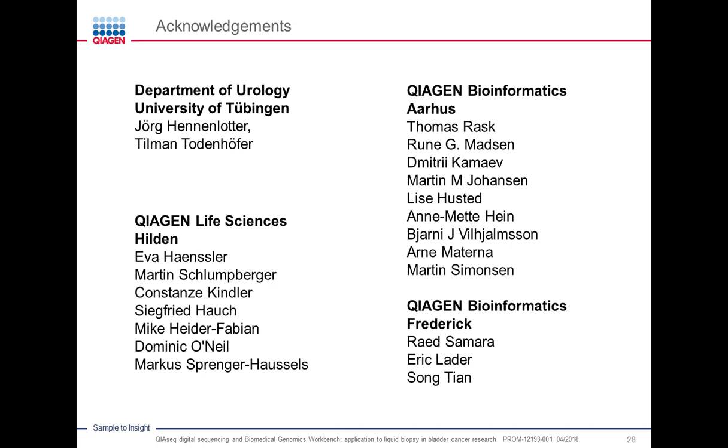And Dr. Lescai, it looks like we have time for one more question. How can you filter the variants you called in the workbench through Ingenuity variant analysis?